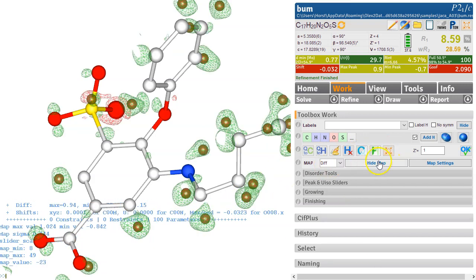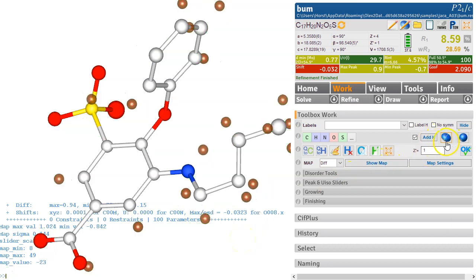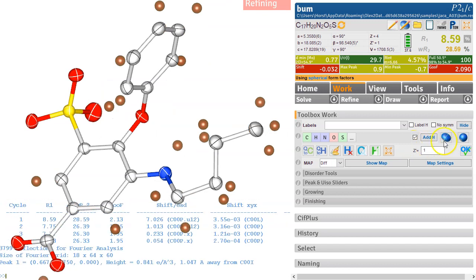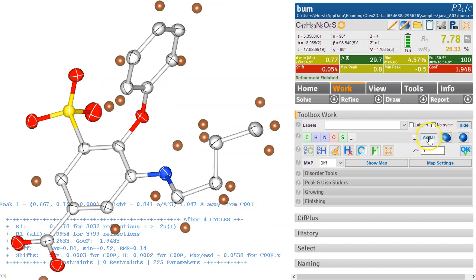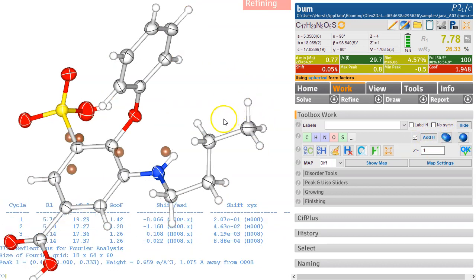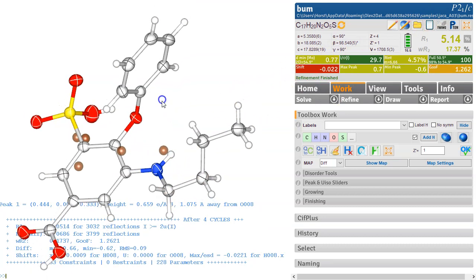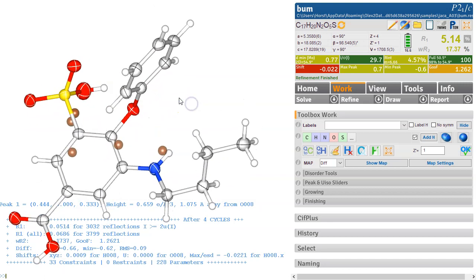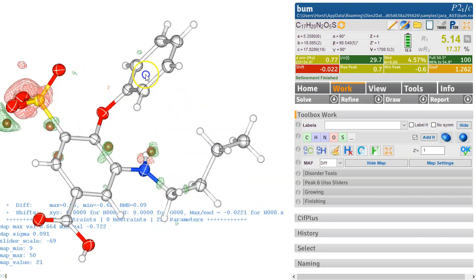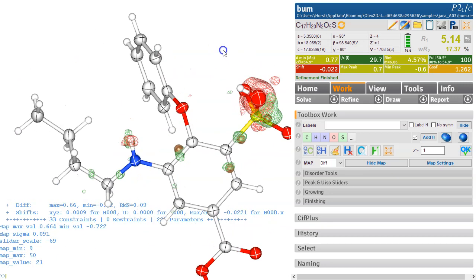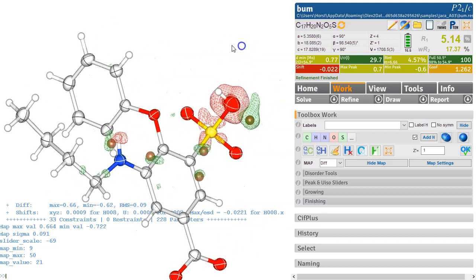This is a keyboard shortcut. You just need to know, hide them up. Control M again, make them anisotropic and then add the hydrogens to it. So that looks pretty good and it's pretty fast and we get a good structure quite quickly, but let's check it. Control M clearly shows us there's a problem. So this thing here is not an oxygen, so this must be lighter. It's red, so there's got to be less free electrons assigned here.